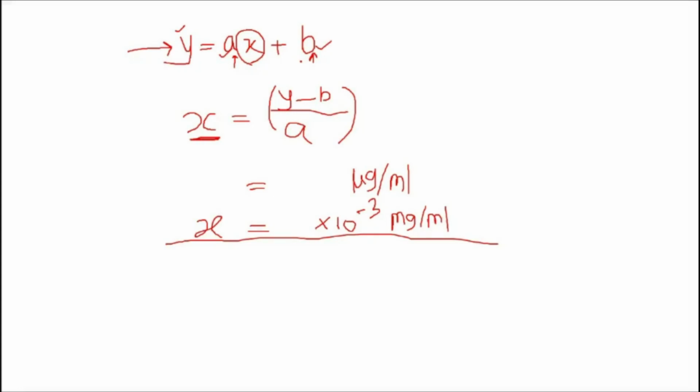Now this value of concentration will be in micrograms per ml. You need to change its unit to milligrams per ml. Okay, this particular concentration that you have got is of the diluted solution of the sample.